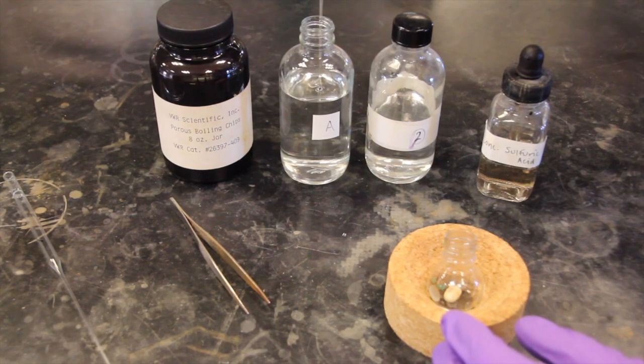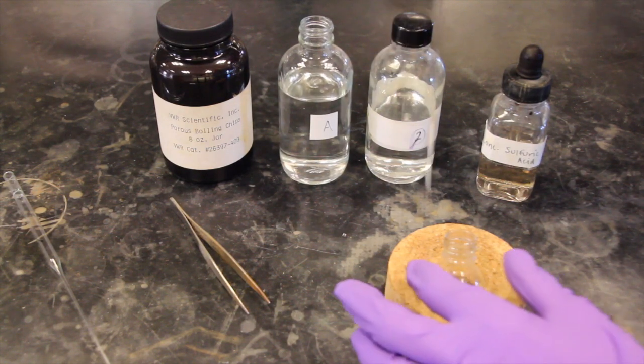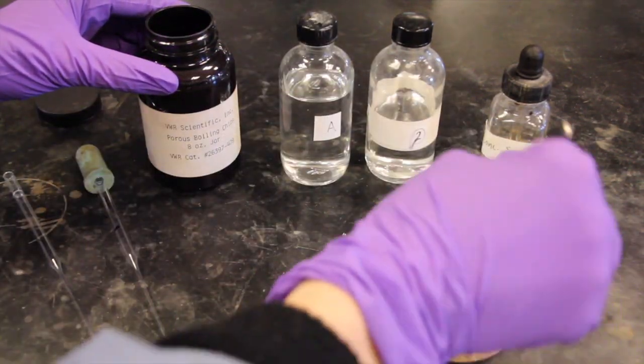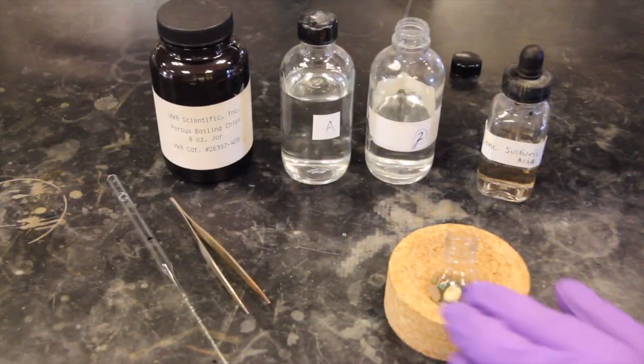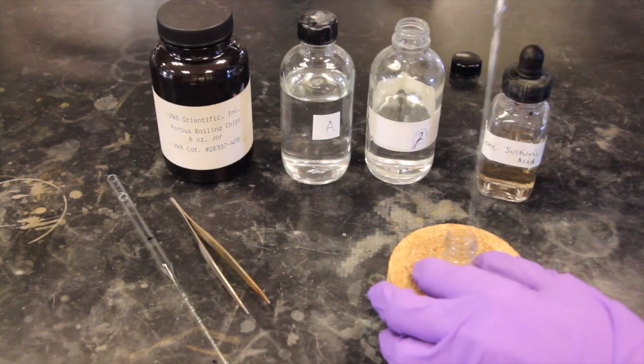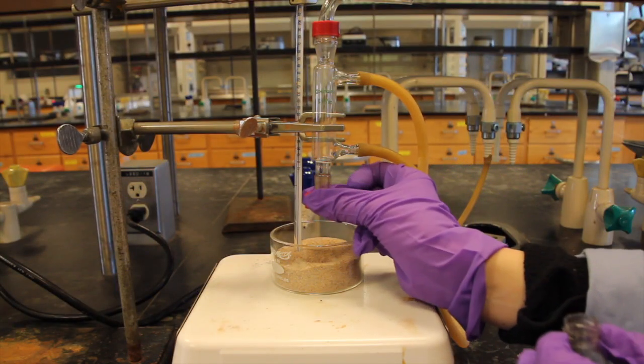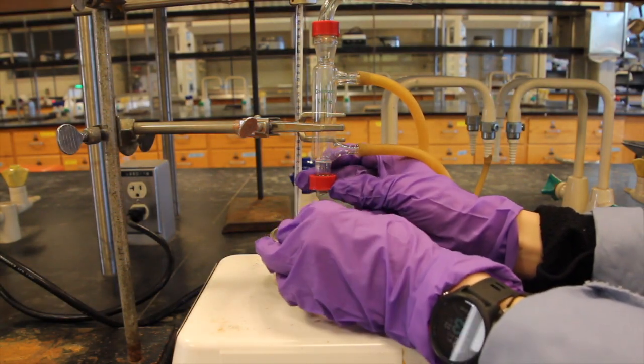Next, add 1 milliliter of your assigned alcohol to your 10 milliliter round-bottom flask. Add boiling chips to the round-bottom, as well as 2 milliliters of your assigned carboxylic acid. Finally, add 4 drops of concentrated sulfuric acid to the round-bottom, cap it, and reattach the round-bottom to the reflux apparatus at your workspace.